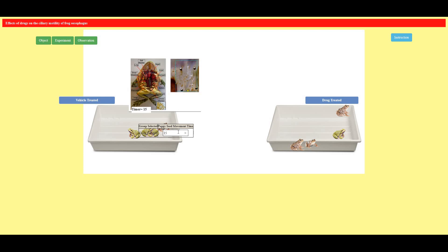So I have got an observation table where on administering the vehicle the time taken by the poppy seed to reach the caudal end and the time taken by the drug administered to reach the poppy seed to the caudal end.